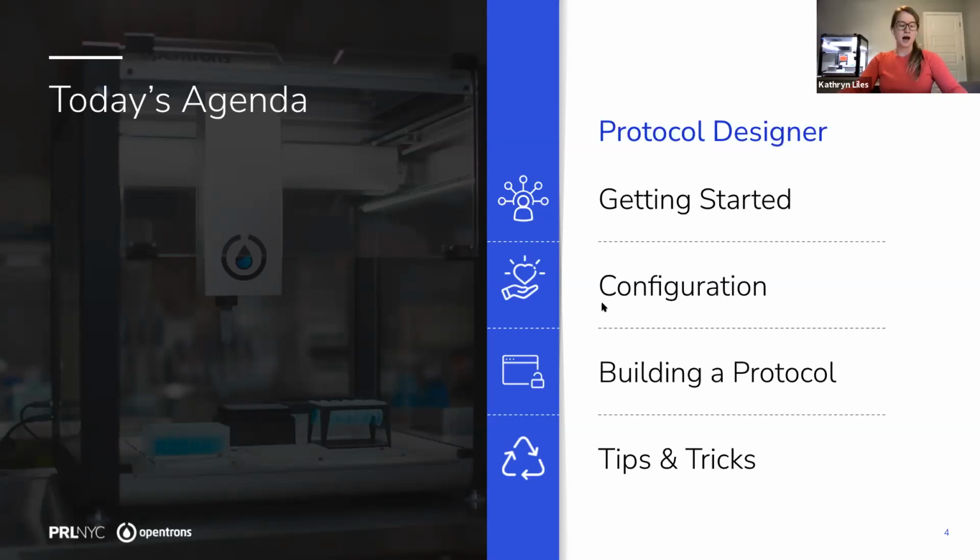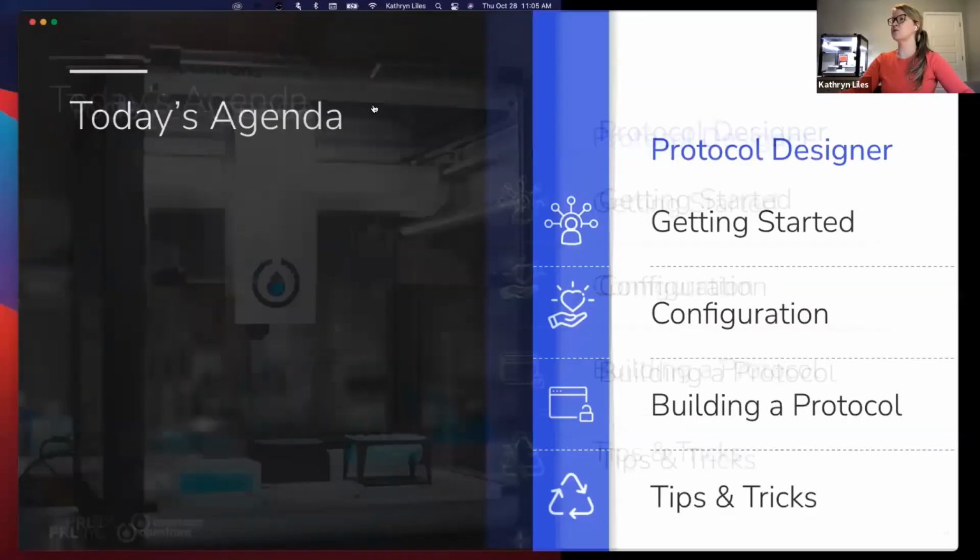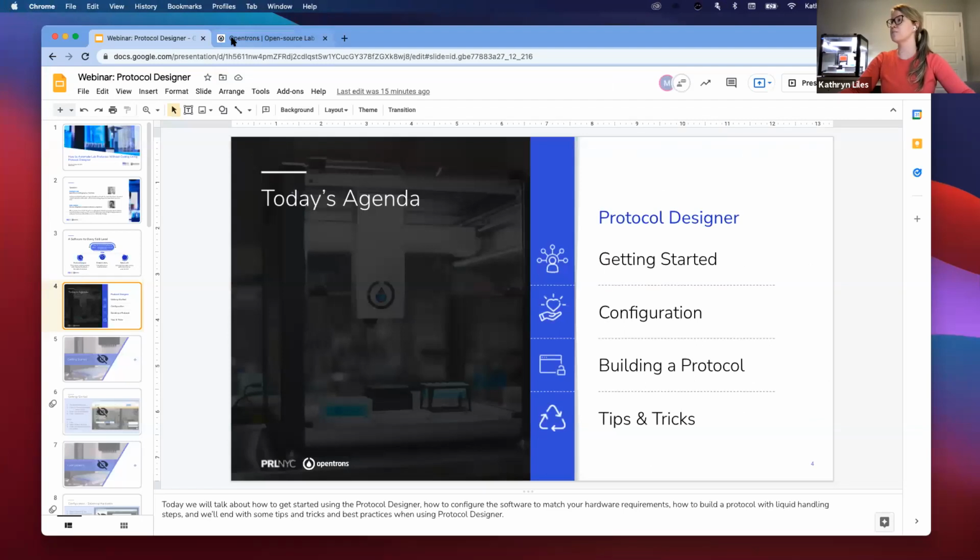All right, I'm going to get out of my slides here because I think the best way to show Protocol Designer is actually to do it live and do an actual walkthrough of the software. So let me transition my screens here.